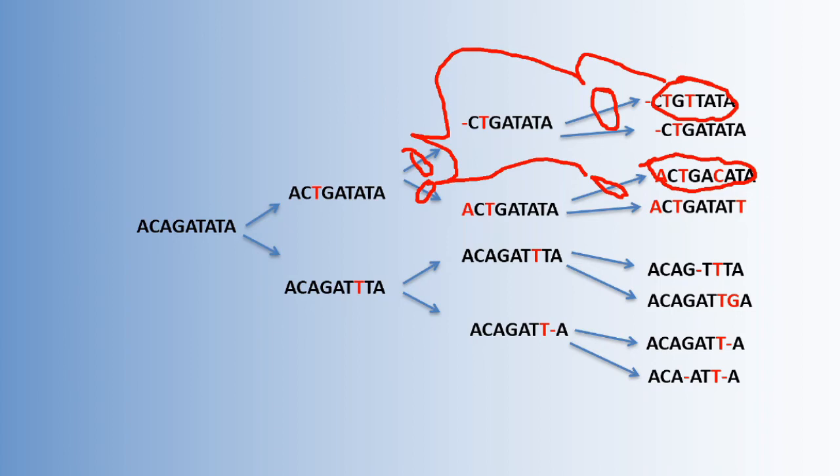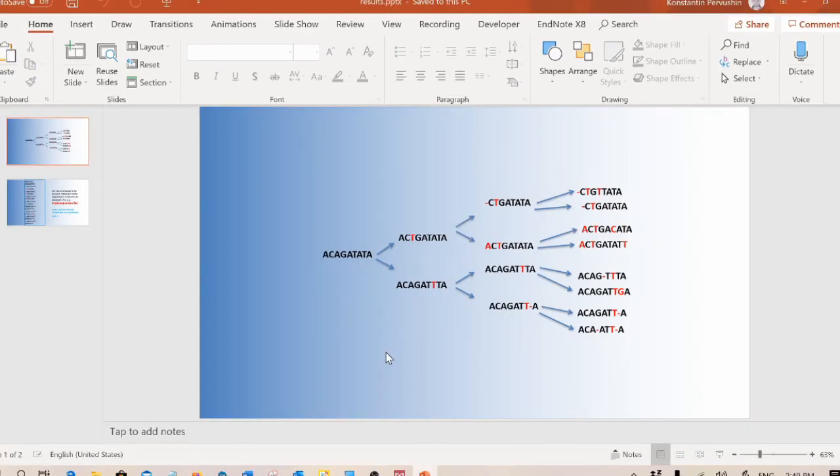It's the same. So it's 1, 2, 3, 4, 5, 6. 6 divided by 2 is 3 generations. Therefore, it's called F3. So looking at the number of variations within the sequence pairs, we can tell how many generations ago they had a common ancestor. That's how we can interpret the genetic distance here.